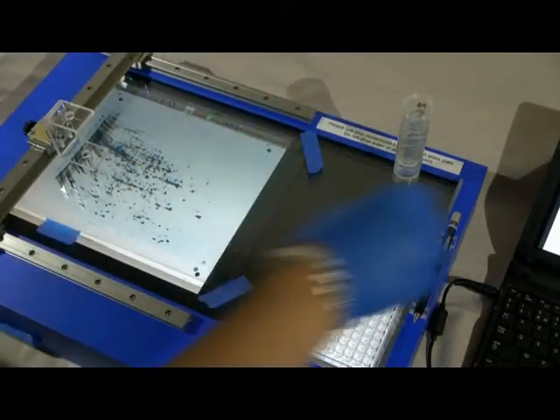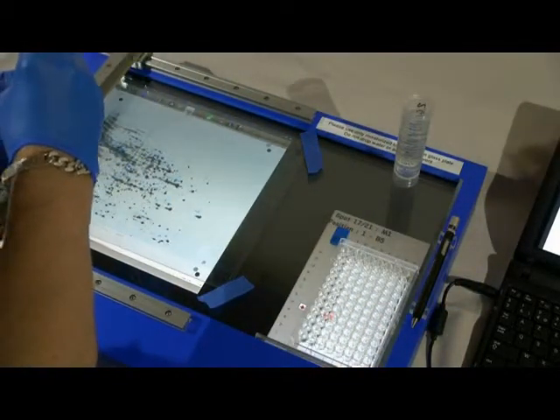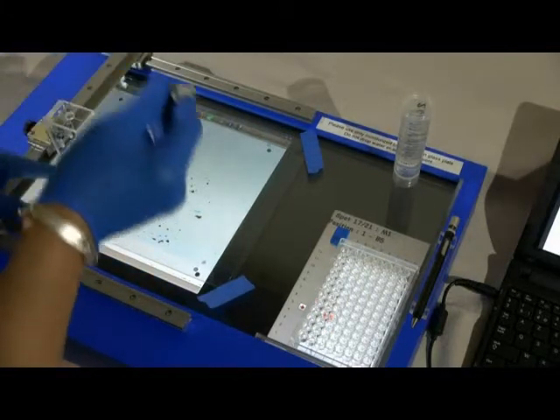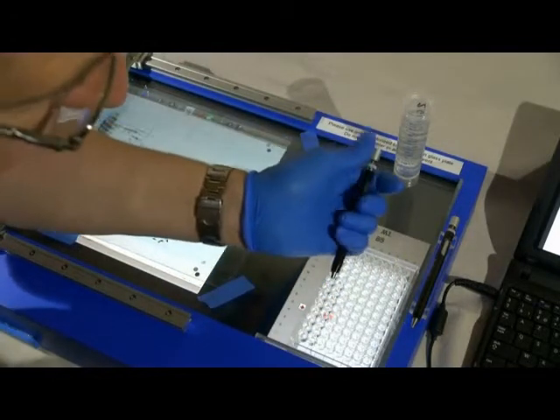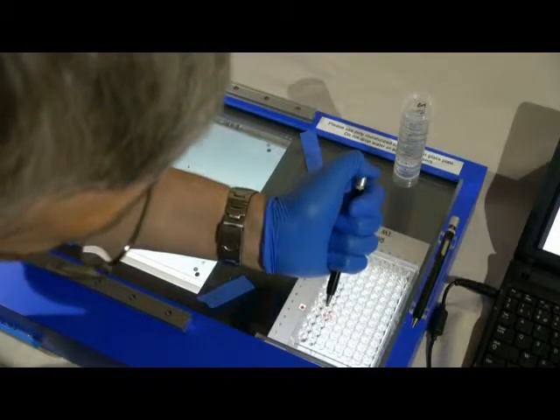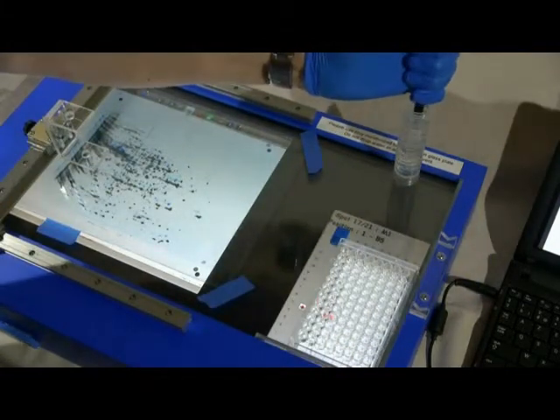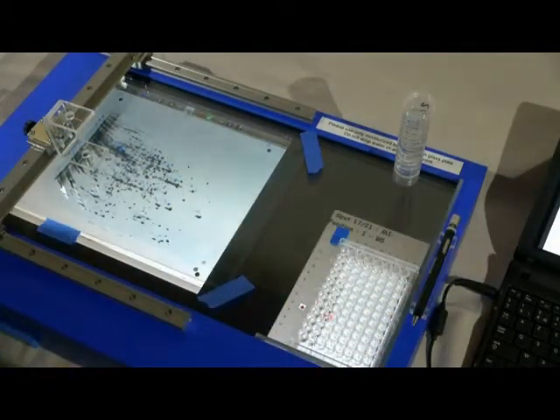Oh, this is the 3 millimeters. I can change for the 1 or the 3 millimeters. But just as an example, I will take the 3 millimeters to show you. It works exactly the same. You can see then there is a big hole now. And if I dispense the plug here, there will be a big plug you can see coming out from my picker. Good. Let's rinse it and go back to the picker of 1 millimeter, 1.5 millimeter.